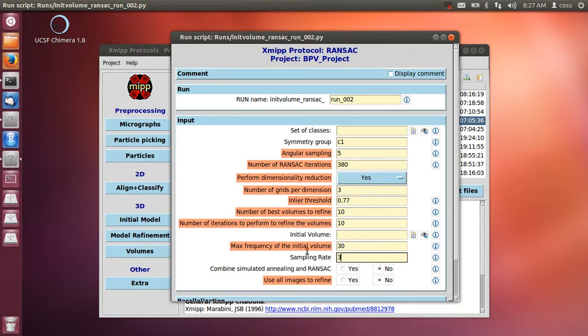You would give these two values here. And remind, as we have covered in the introductory tutorial, that we take random subsets of your images, so for doing these random subsets you need to have enough classes. If you have very few classes, then you better don't do this dimensionality reduction, and you take here the number of classes that you want.